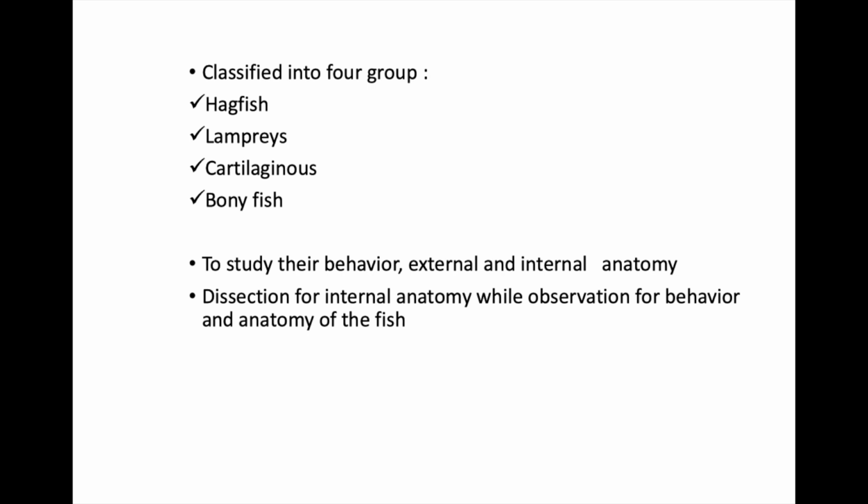The main point of focus of this experiment are to examine or study their behavior, external and internal anatomy of the fish. For the experiment, two ways was used to study the fish, which is dissection for internal, while for external anatomy and the behavior, the observation was used. This method will allow their relationship related between the structure and their function compared to other organisms.